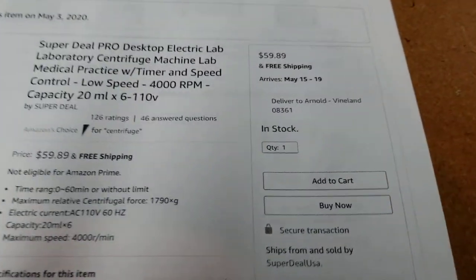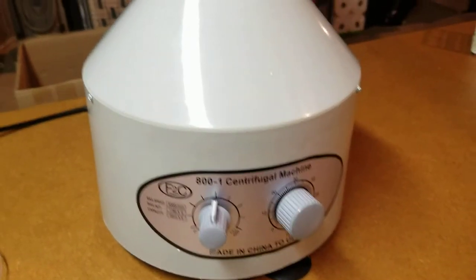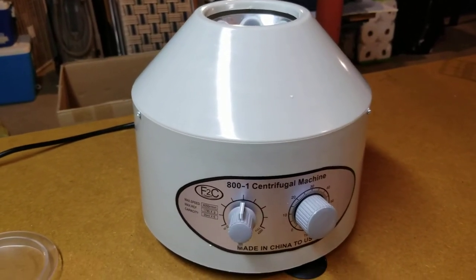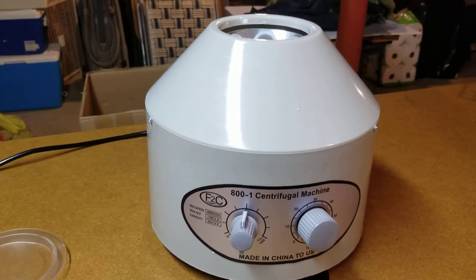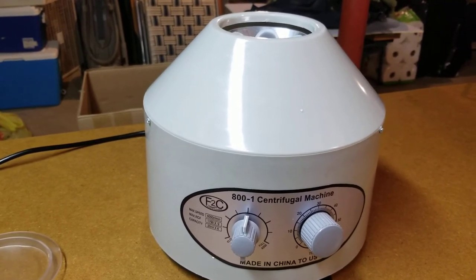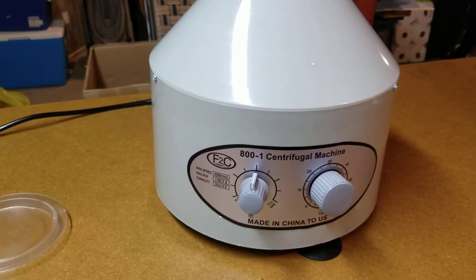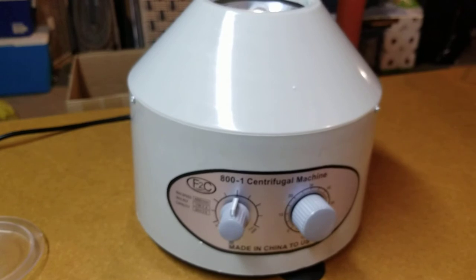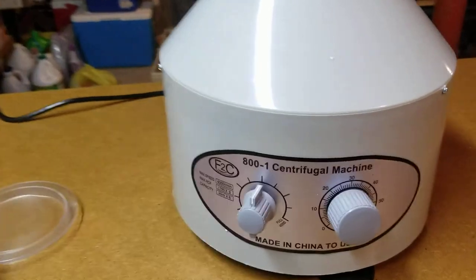So I thought about getting a centrifuge, and this one was only $59.89 with free shipping. For my purposes I don't do it that often, but I finally broke down. I really would like the flexibility of testing soil samples from different garden beds as needed. I use the Soil Savvy tests, which are very good, but they cost $30 a piece and take a couple of weeks — this gives you results right away.